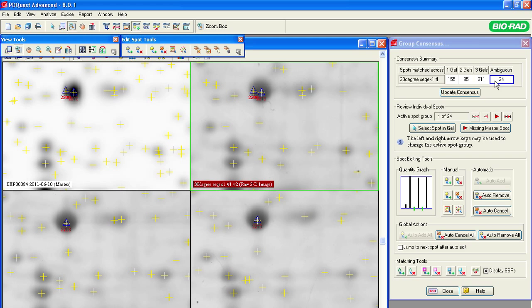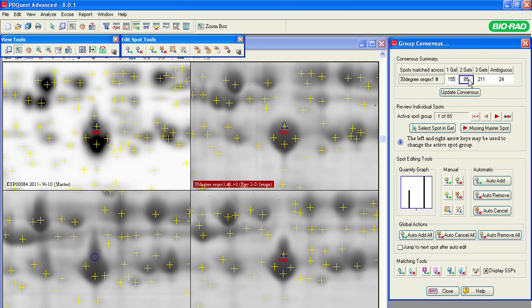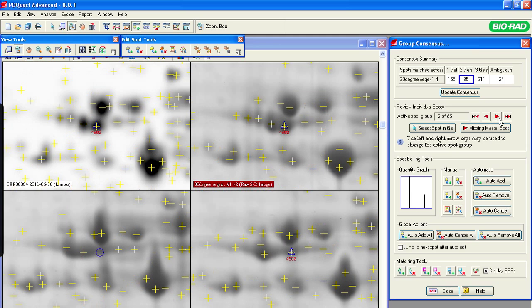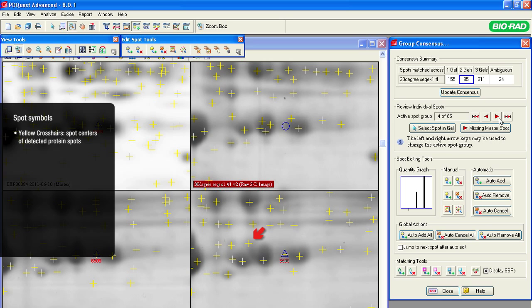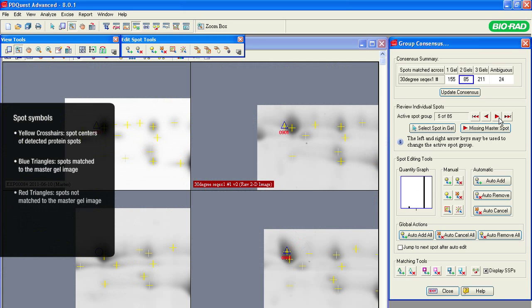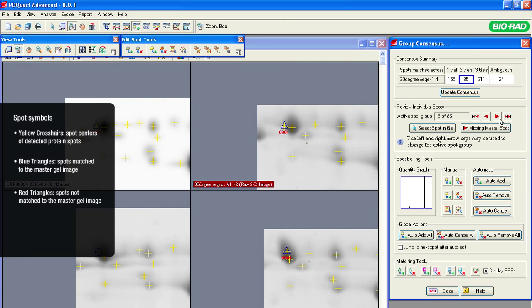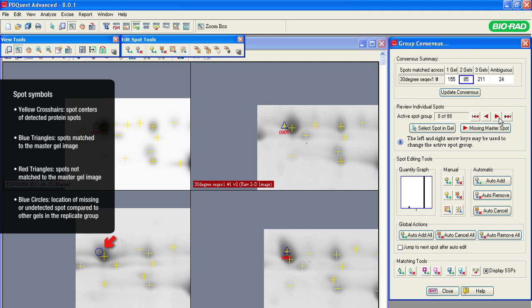Selecting a cell in the consensus summary table allows you to visualize those spots on the gel images. It is useful to first analyze the most obvious anomalies. Click on the Two Gels cell and, using the arrow, advance through the spots on the gel images. PDQuest software uses symbols to indicate the spots being reviewed on each gel. The yellow crosshairs refer to spot centers of detected protein spots. Blue triangles refer to spots matched to the master gel image, and red triangles refer to spots that are not matched to the master gel image. Blue circles are used to indicate where on a gel a particular spot is missing or undetected when compared to the other spots on other gels in the replicate group.